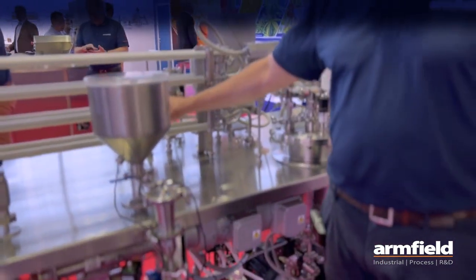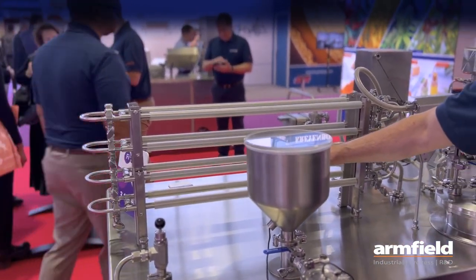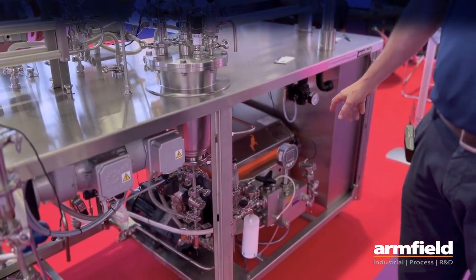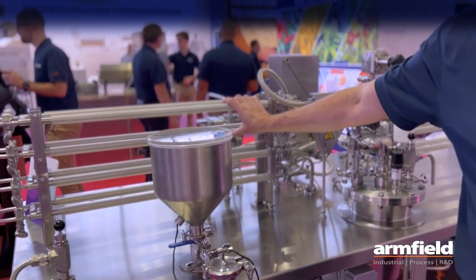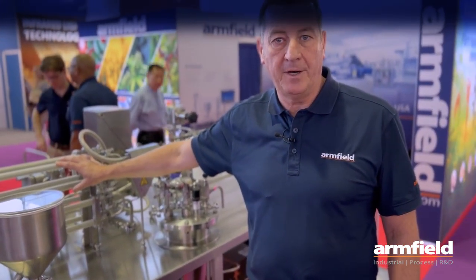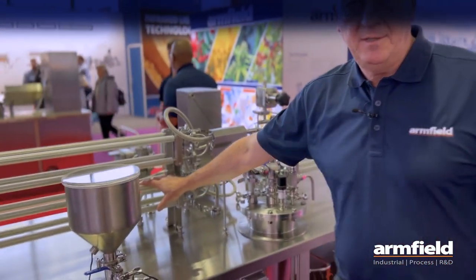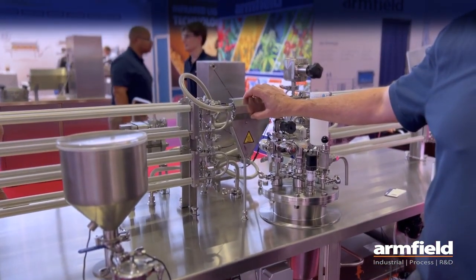The system has preheat tubes for controllable preheat, and from there you can go to the integrated homogenizer. The homogenized product then goes back into your final heating section on tubes, allowing you to hold your product up to a maximum of 150 degrees depending on the holding time required. Should you not wish to go to indirect heating, you have the option to go from preheat to your homogenizer but then into direct steam injection instead.